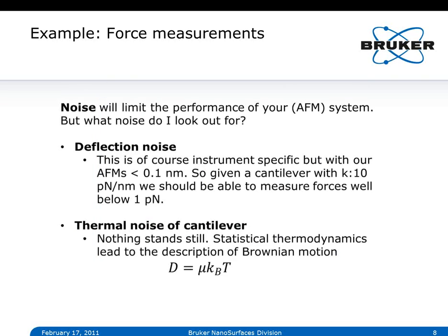There's a nasty effect that comes into play, unfortunately, and that is called noise. And it's actually interesting when people talk about noise, because people go to great lengths of looking at the noise of the AFM system.